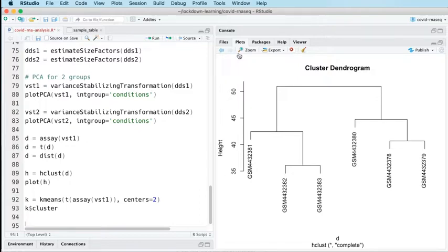in terms of the quality of this as an experiment. Now that we've subsetted out to 2 separate experiments, we can be relatively confident that the experiment looks the way that we expect it to look, and that we will be finding some differentially expressed genes when we get to that bit of the analysis. So what I wanted to do today was to get through the remainder of that analysis, from this point that we're at now, where we've done a certain amount of assessment of the quality of the experiment.